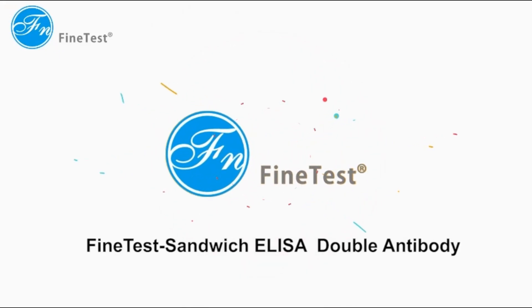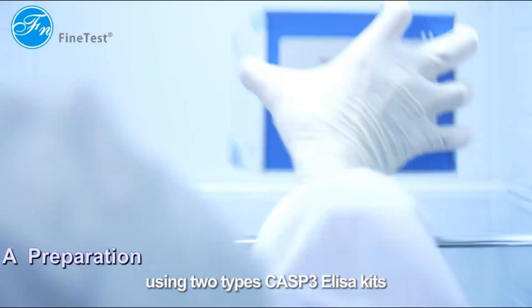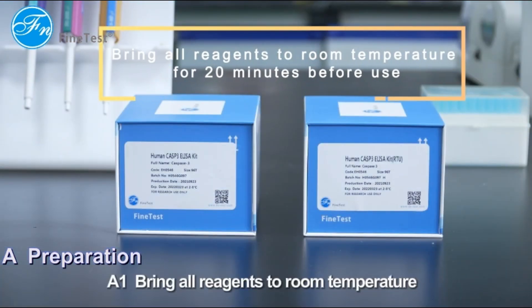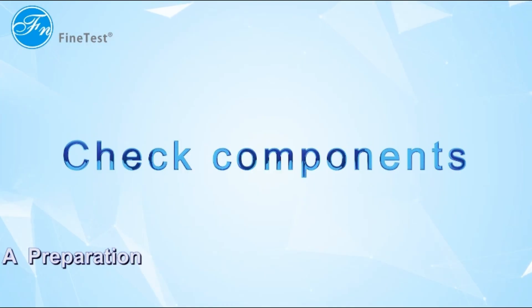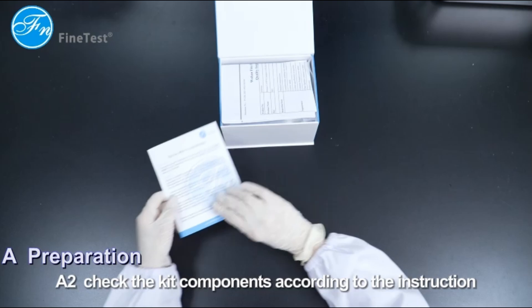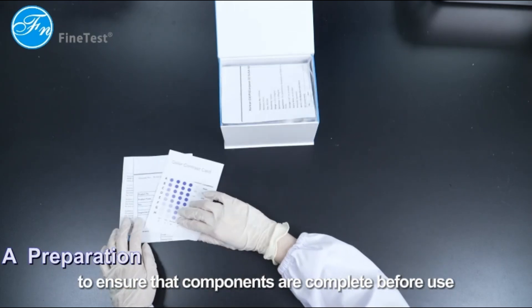Preparation. This video will demonstrate different procedures using two types of CASP3 ELISA kits. First, bring all reagents to room temperature for 20 minutes before use. Check the kit components according to the instruction to ensure the components are complete before use.